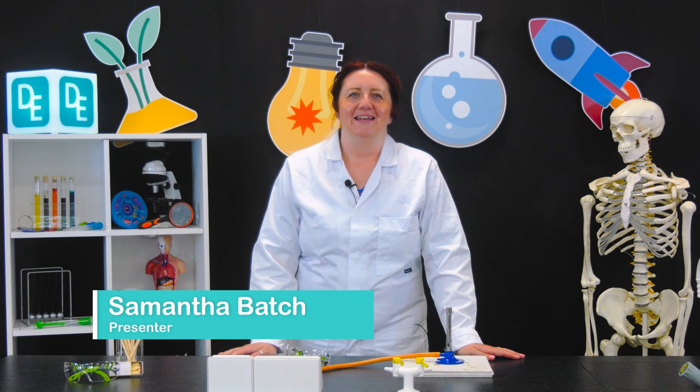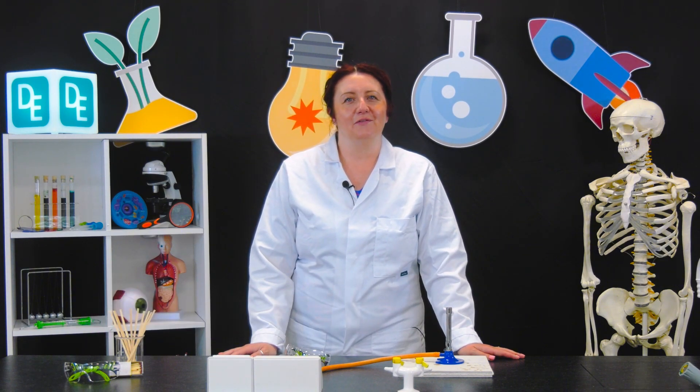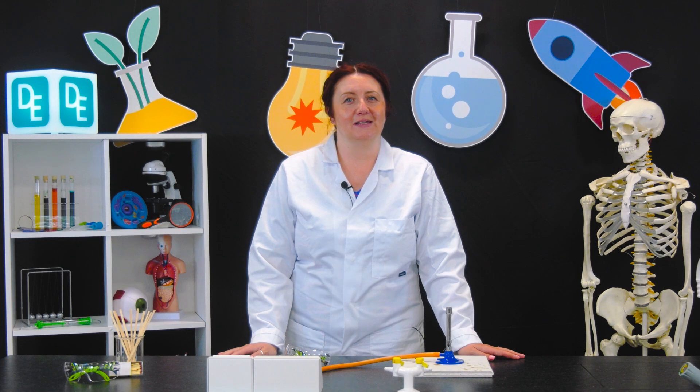Hi, I'm Sam. In this video I'll be walking you through how to use a Bunsen burner safely and effectively for your science experiments.